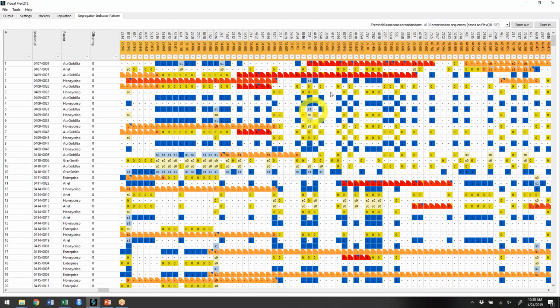And sometimes where there's multiple markers involved, the first marker that is involved, the first one that is reported here is this one, but for this stretch, it's this one, and maybe for another stretch here, it's this one. And so the start marker might actually vary, but the double recombinations that occur might be occurring around the same markers time and time again.